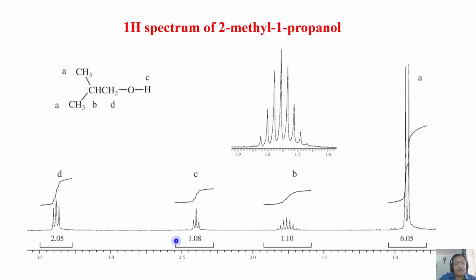Generally, in the proton spectra of several molecules you see in various books and literature, when there is an OH proton, you will see a broad peak like this. But I don't see any broad peak here. We have four different types of protons, so we have 4 groups of peaks. That means one of them must be OH. Now, what could this OH be?